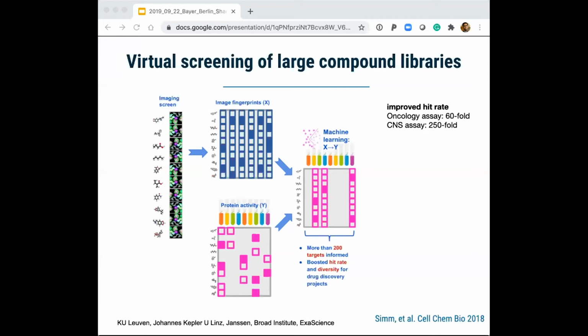Large-scale assays for drug discovery can be expensive and impractical, particularly for model systems that require primary cells, organoids, or whole organisms. But as an alternative, an international team, including Janssen and many others, demonstrated that data from a single high-throughput imaging assay can be repurposed to predict the biological activity of compounds in other assays, even those examining unrelated pathways or biological processes. These proof of concept results suggest that image data from high-content cellular assays can be leveraged to carefully design chemical compound screens and boost hit rates.